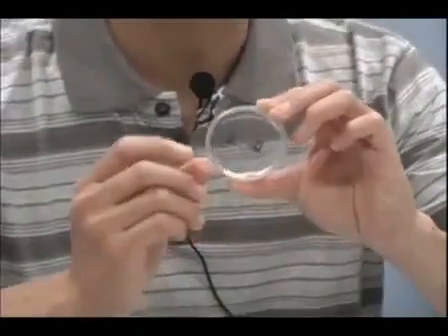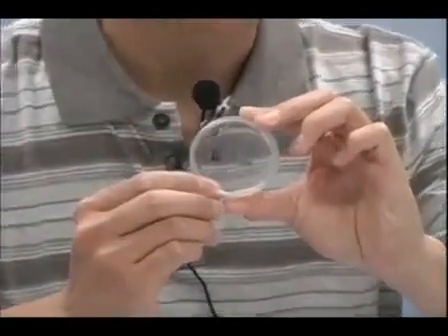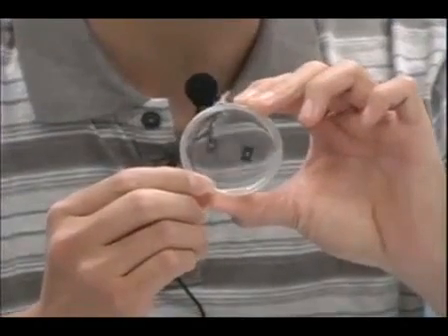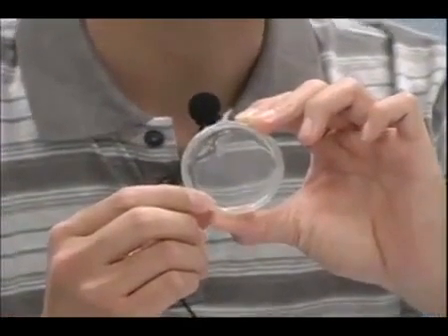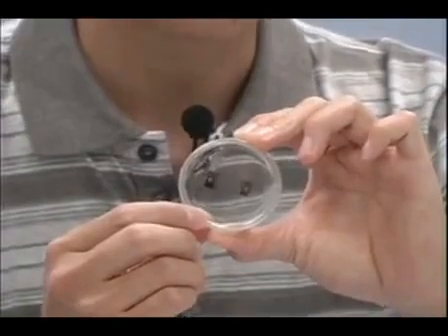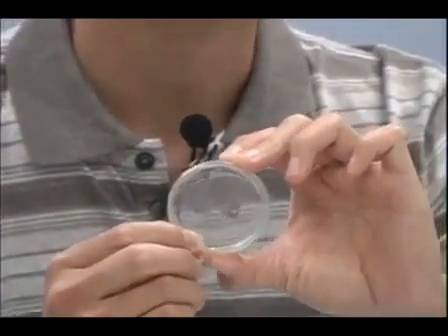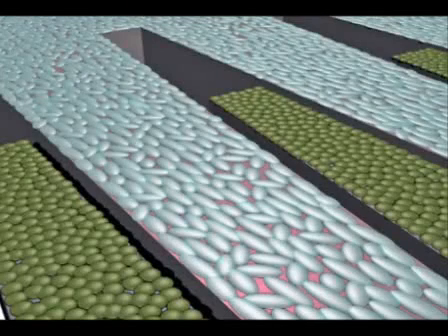The devices look like little combs that lock together, and they allow us to precisely manipulate the interactions between two different populations of cells. Today we're going to study the interaction between liver hepatocytes and supportive stromal cells, specifically 3T3 fibroblasts. Cells are cultured on the top surface of the combs so that by shifting the comb fingers, you can move the cells and change their spatial arrangement.